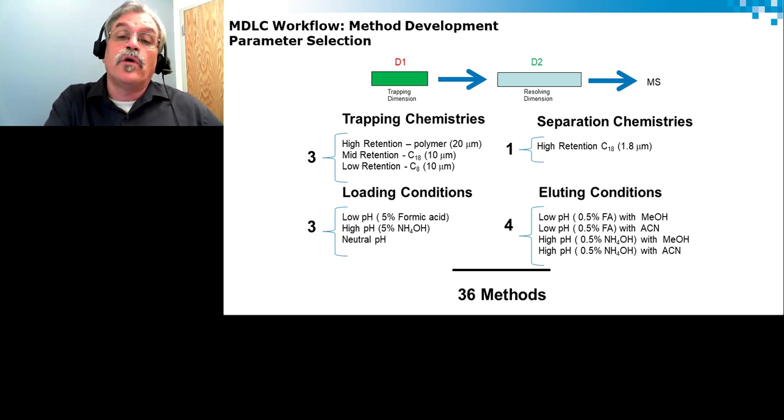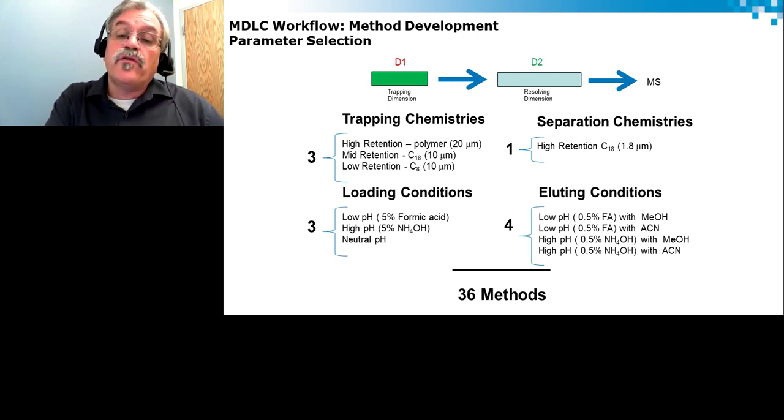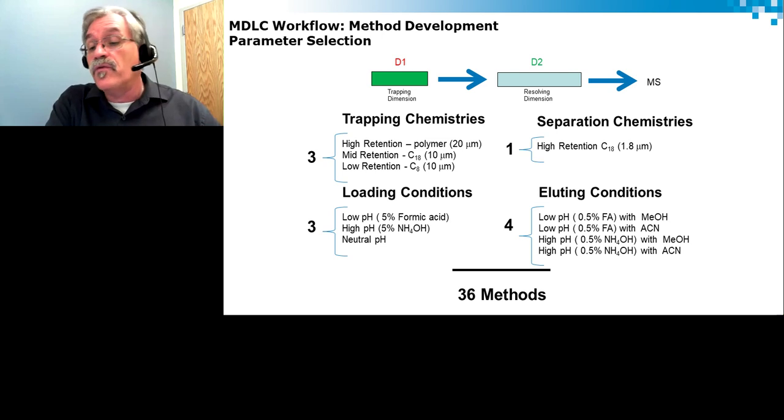Now, in the world of multidimensional chromatography, one will be confronted with the concept of multi-residue application versus the concept of multi-method application. Multi-residue is a situation that was a necessary evil because of lengthy extraction processes.